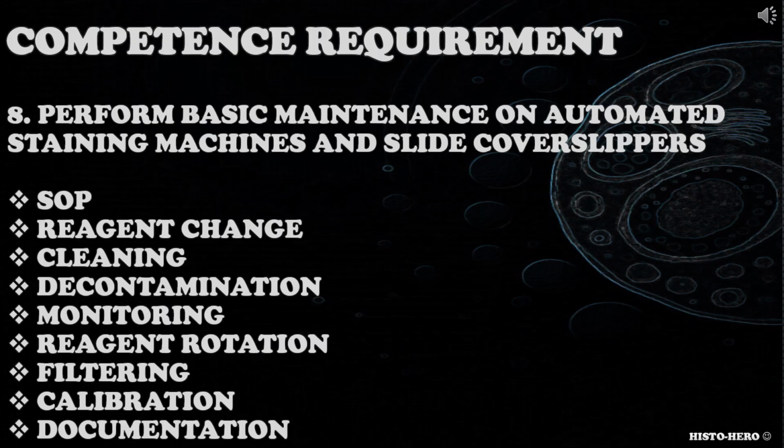Do they follow local methodology and SOPs when performing maintenance? When addressing this competence requirement, candidate could consider SOPs, reagent change, routine cleaning of the equipment, regular decontamination, monitoring of reagent evaporation and reagent levels, reagent rotation, stain filtering, if needed, associated record keeping and documentation.